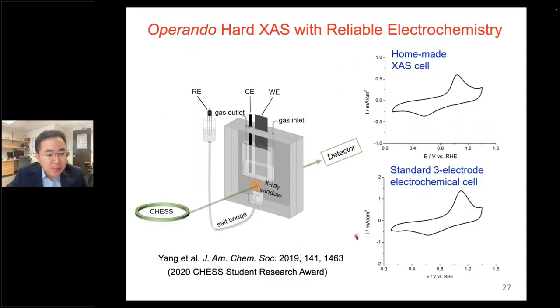So I would just give you a sense from my early study, with this standard electrochemical cell, where we can have a real reference electrode through a salt bridge. This can achieve almost the same electrochemical response as a standard cell on the bench. So here, the electrochemistry is very quantitative under the hard X-ray beamline.